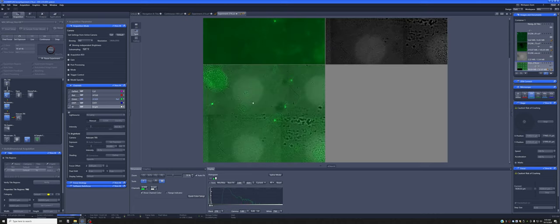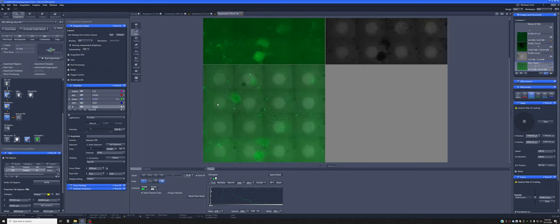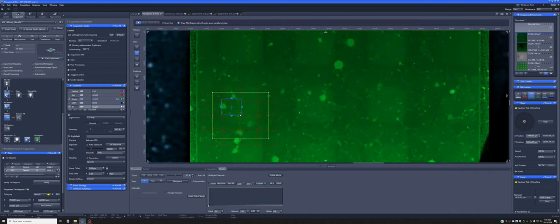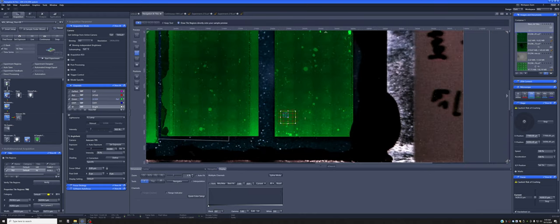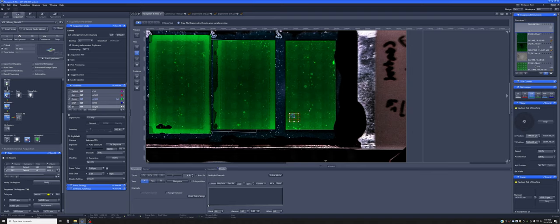So as I said, this is not a tool that you always need to use, but it can be quite helpful if the resolution of the five X, which we used to originally make these maps is insufficient for what you're trying to do for subsequent confocal imaging.